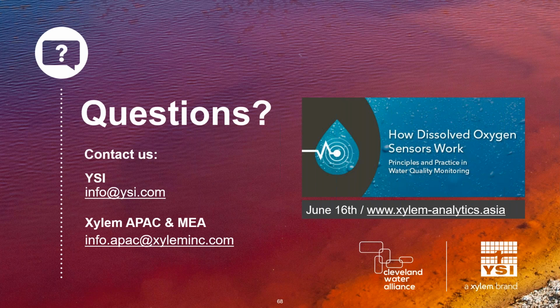Terrific, thank you. A member of our audience needs to check pH at a heavily polluted water. With a pH of 12, what would be the frequency of calibration that you would recommend?